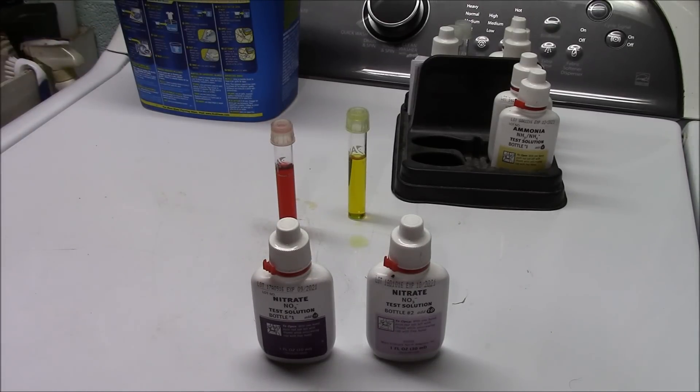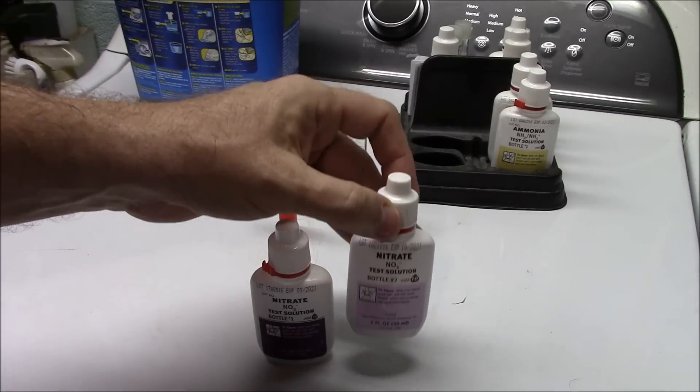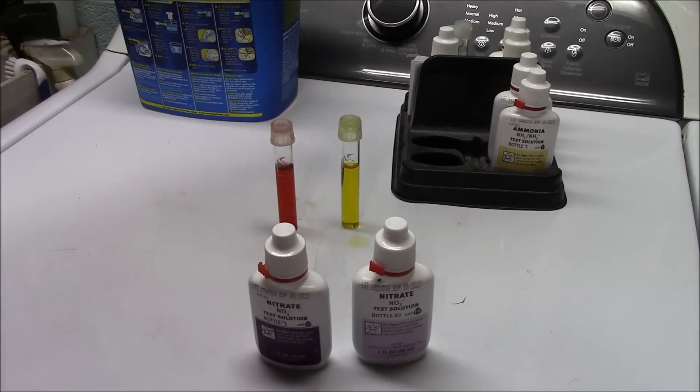The nitrates in my 125 are pretty high right now. It wouldn't kill me to do another water change in a few days — I don't want to do two huge ones back to back and shock the fish. I've always said nitrates aren't as deadly as everybody makes them out to be, so I'm not overly concerned about that bright red vial just yet. The two main things to point out from this video: shake bottle two vigorously, and measure the water properly using the meniscus.